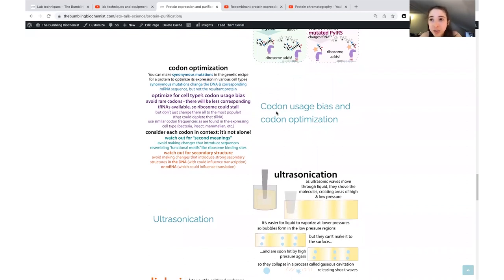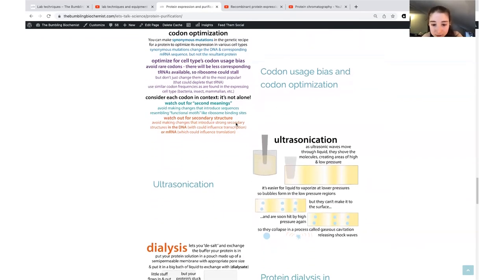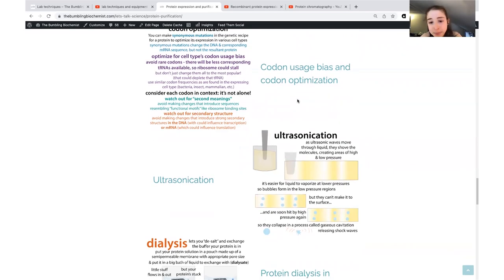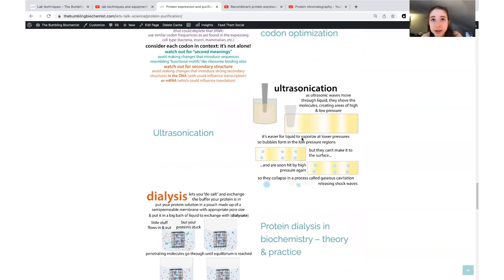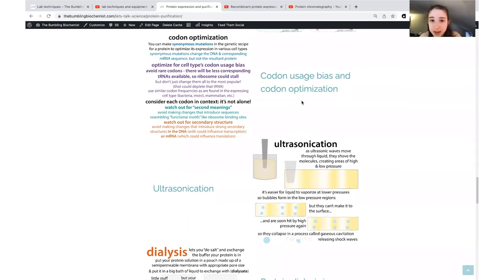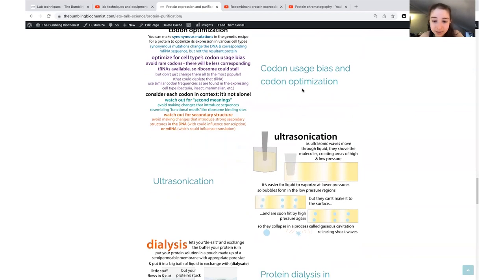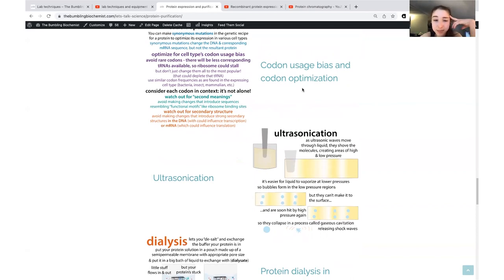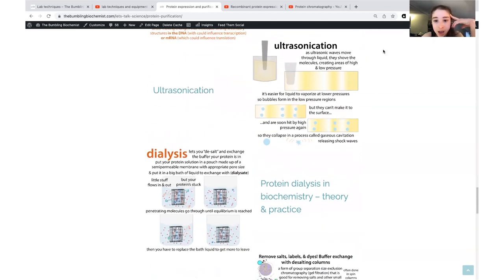And so by using the codons that the cells use most, you might have more success in getting your protein expressed, because they're not going around waiting for a rare tRNA to come. You can also use, for bacteria expression, Rosetta strains that have extra copies of the rare tRNAs on a plasmid in the cells so that they'll more likely make them. That way you're changing the cells rather than your codon sequence.